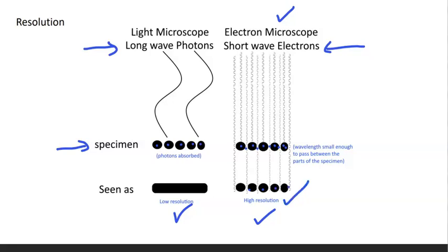We would use the phrase high resolution. So the advantage of an electron microscope is the short wavelengths of electrons, which allow us to produce high resolution, highly detailed structures. Now, in order to prepare the specimens for this, there are preparations of fixing and then staining.